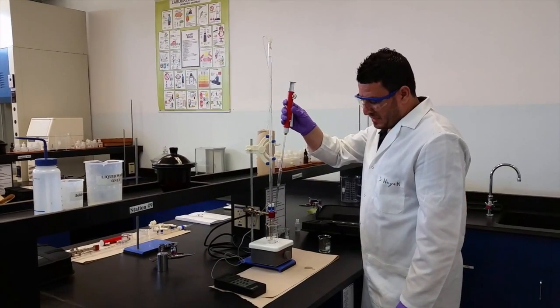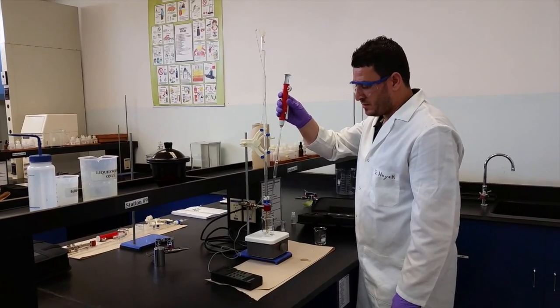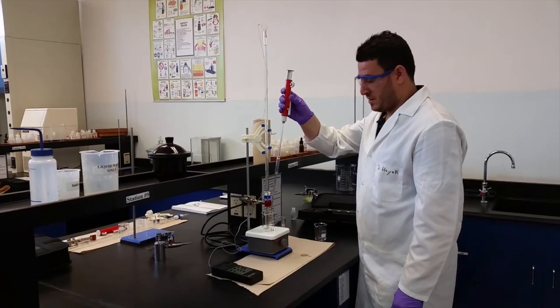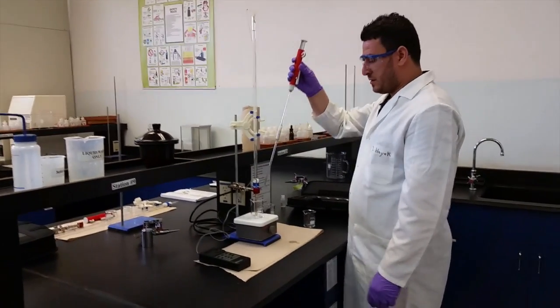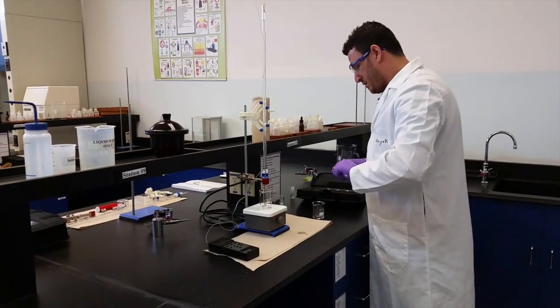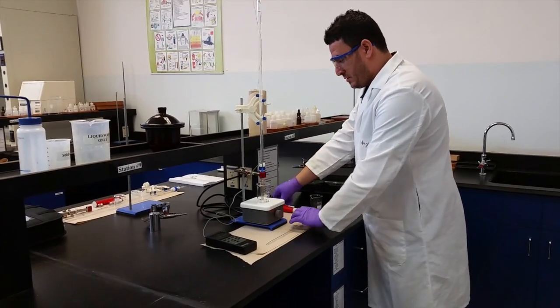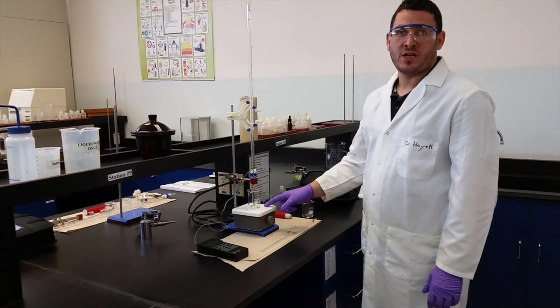Now, 10 milliliter might not be enough to reach the probe of the pH meter. But as you know, for the titration, we use the number of moles, and adding water to the analyte doesn't change the number of moles, it changes the concentration.